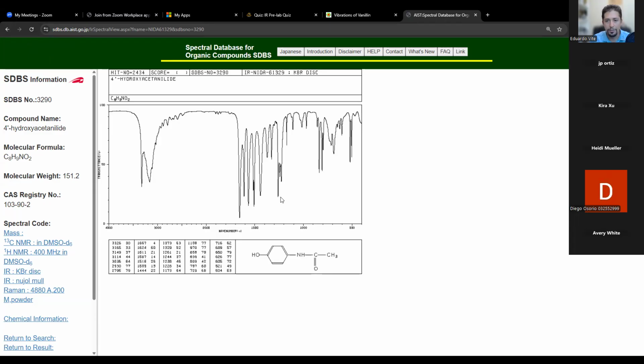You have a carbon-nitrogen stretch at around 1200, 1250. You have a single nitrogen-hydrogen stretch at around 3400. This time it looks like a sharp peak rather than a little weak signal. That is because that aromatic ring introduces new stuff into it. So you can definitely see that the amine is still there, even though it doesn't look like the examples.